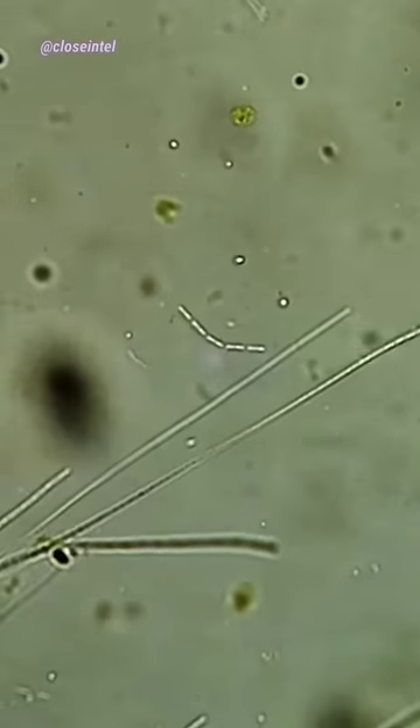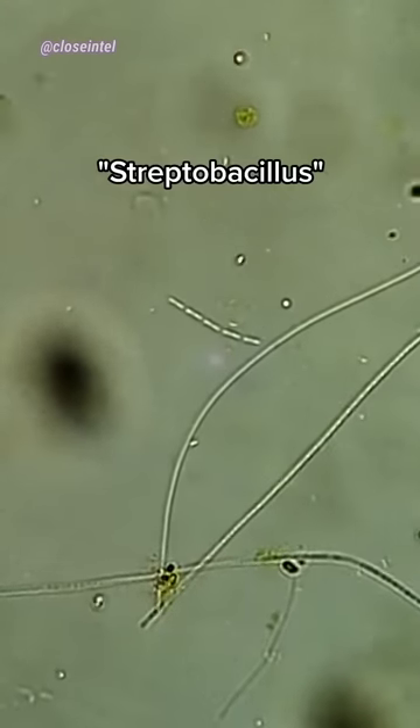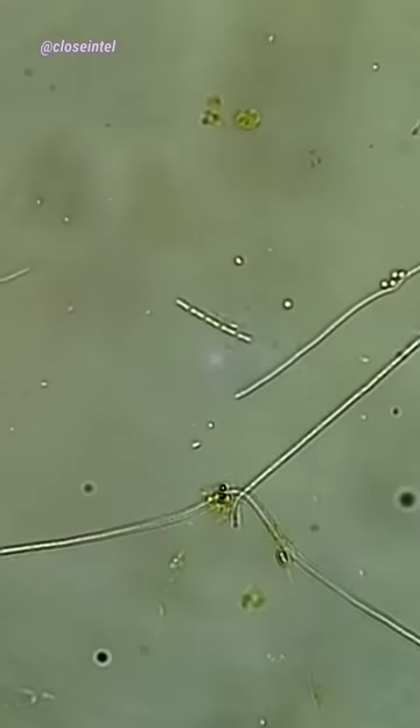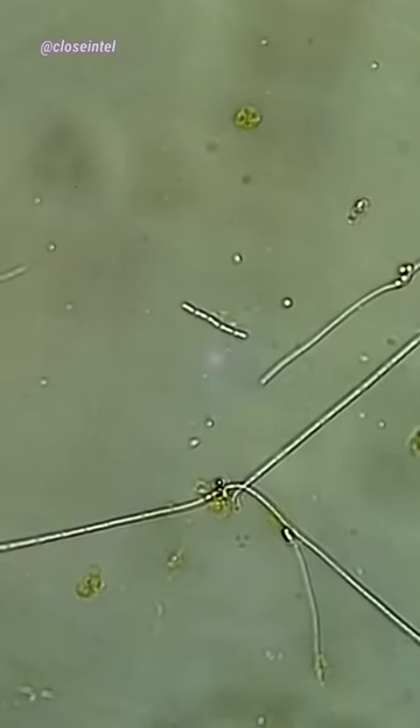When zoomed in at 600x, we can see these rod-shaped bacteria in chains, also known as streptobacillus. You can tell when the vinegar comes in contact as the chain shrivels up and stops moving, along with the other surrounding microbes.